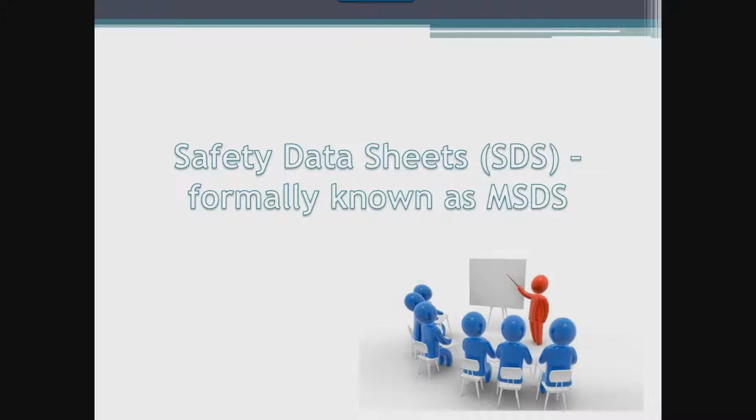On the same hand, if you are an organization that has an electronic filing system, it is imperative that your staff are able to locate these electronically. As part of an auditing process, includes staff talking you through how to locate a safety data sheet via the electronic filing process. Inspectors like to ask this of staff during an inspection process, so it is important that staff are able to perform this function.